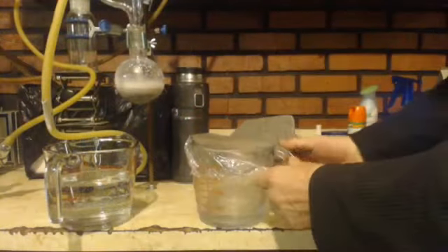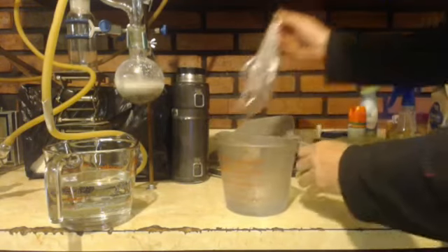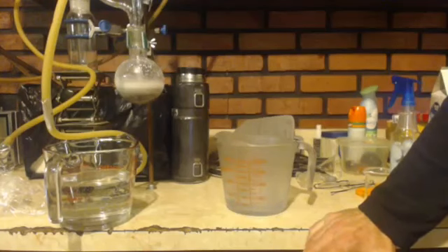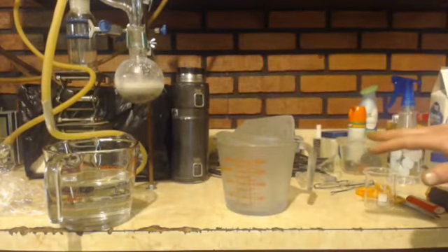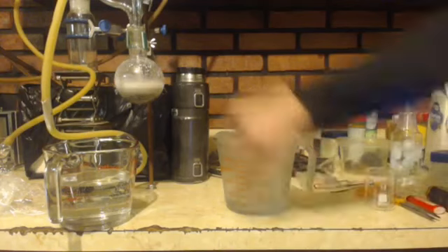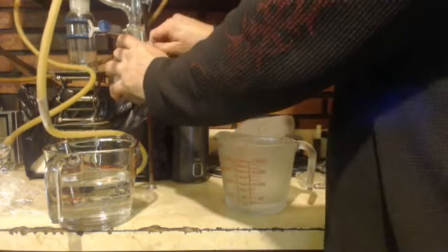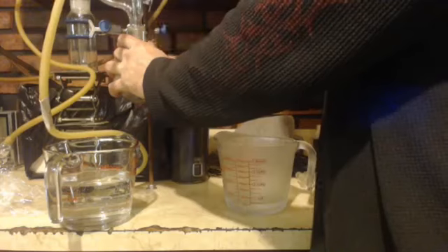I put this hydrochloric acid in the ice box, took it down below zero, and I split it up into three almost equal parts. You know, I'm not being exact about it. We only made a third of a mole, remember? We didn't make a full mole. And we made a mole of HCl though, remember? So this is a third of a mole right here. So that should equate to making our tetrahedral intermediate into the acid.